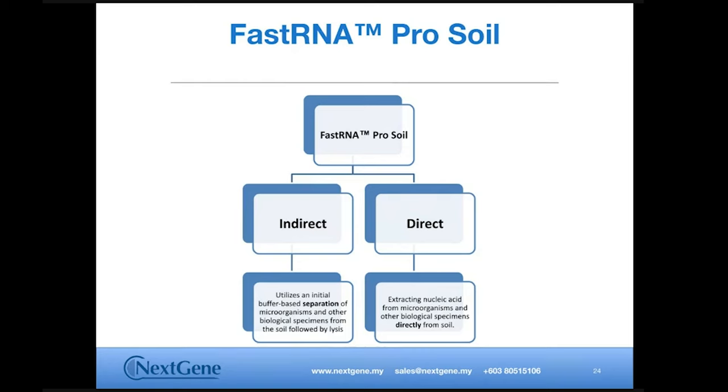Okay. So then the second question is from Asa. In extracting DNA, is it workable for mushroom tissue, and is there any result to support it? Okay. So here I would like to share some links that I just found. For more information, I will need to search more, and then check on using the FastDNA kit or FastDNA spin kit for mushroom sample.